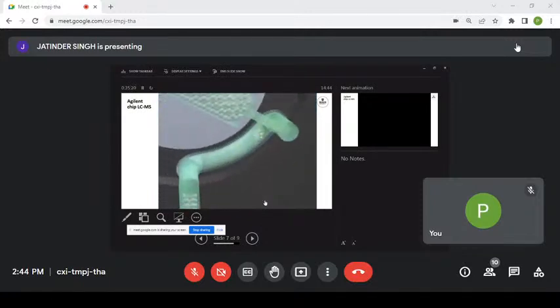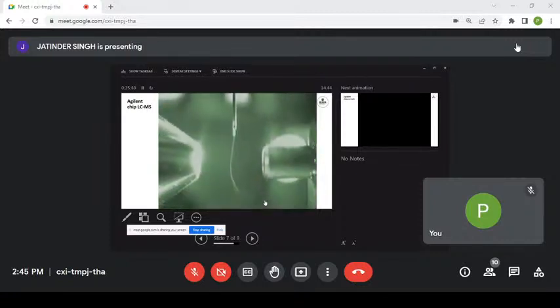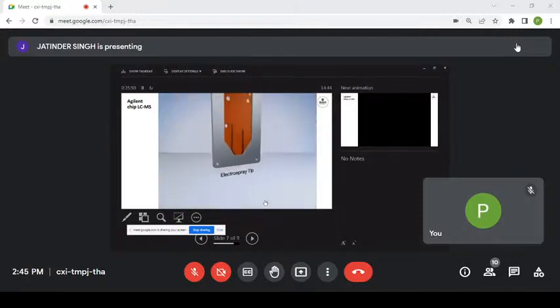Then they're all enriched from one side of the column and they get eluted in a very small plug into the separation column. You see the shoppers? There's the man, not interested at all. Running to go to the electronic interface, love their computer games. And then they go into the electrospray. So that's how electrospray looks like. Mesmerizing. You get that nice little cone formed. And then it just sprays into the mass spec. The mass is measured.